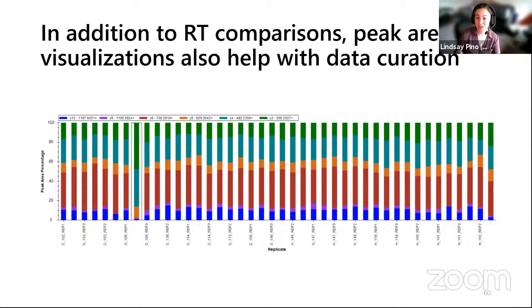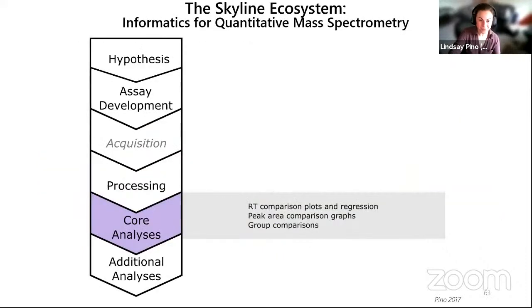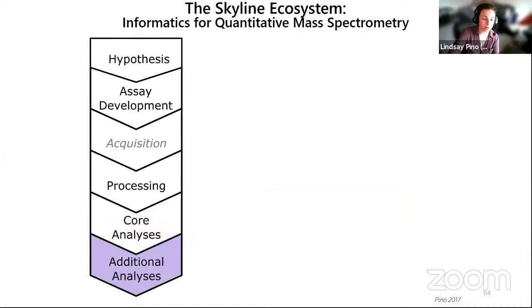So this is just to show you that even if a software is doing a really good job picking peaks, going through and manually curating for some of the things you care the most about can be very important in getting the results that you hope to get. That's just a couple of these manual curations, and I think we're doing that a lot more tomorrow too.